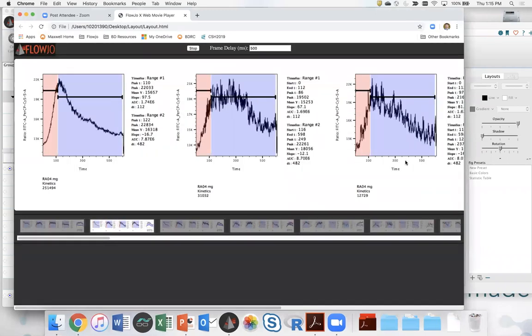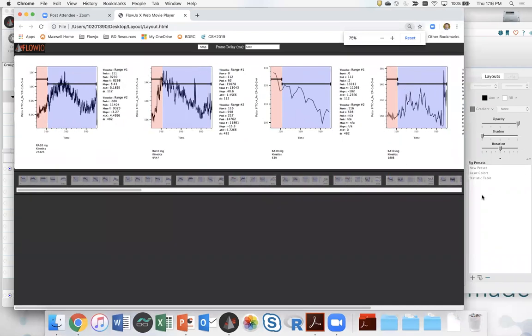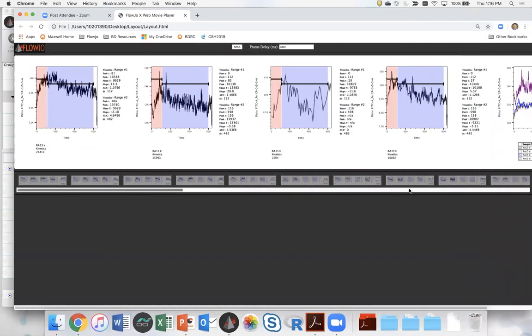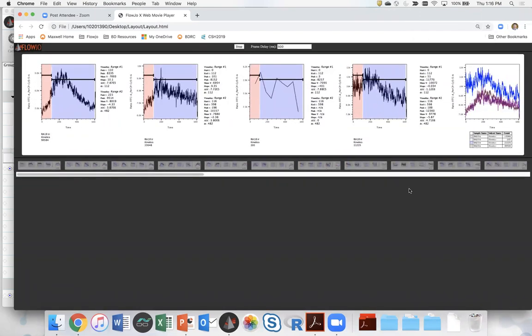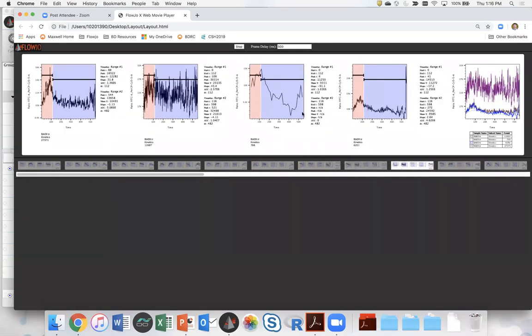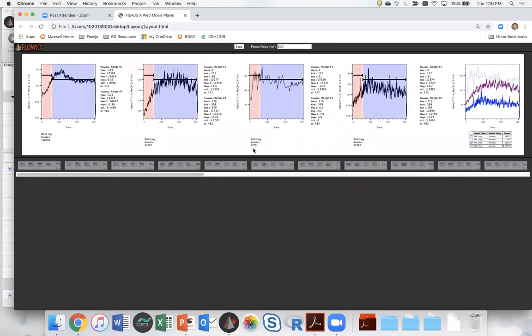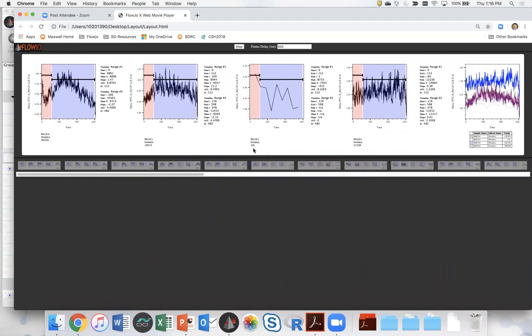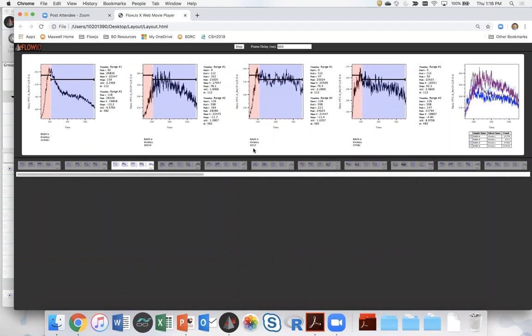Okay, and we have the ability to scroll through our data. I'm going to zoom that out a little bit and see how overall the comparison of these various kinetics populations looks. Just to be aware, the TH1s here, there were very few in many cases. And so we will see a few plots here that just really look like a line chart of what it would look like if you graphed 18 items or something to that effect.